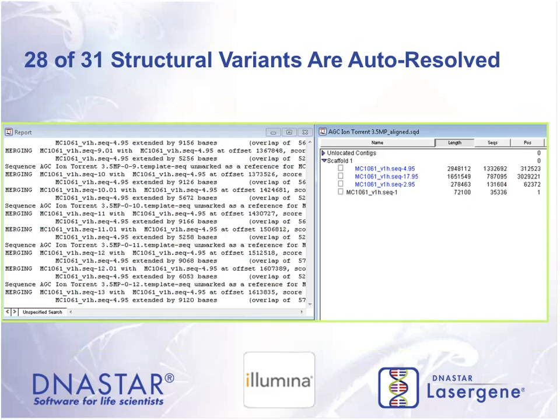and they're unresolved gaps. So I've gone from 31 down to 3 gaps, and I know from this organism these are some larger phage insertions in this particular genome. So I've just eliminated a large percentage of the manual effort, and this assembly takes about an hour of time. So really a great way to speed up some of the assembly and analysis of microbial genomes.